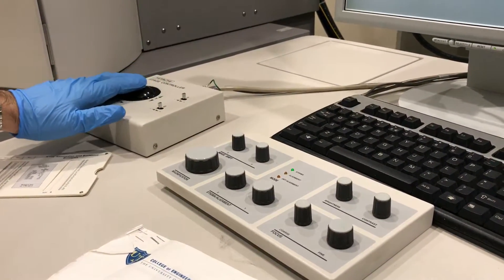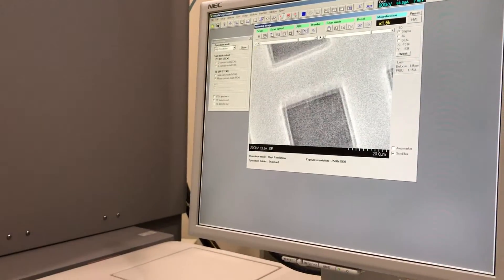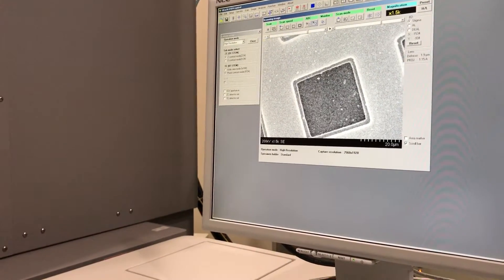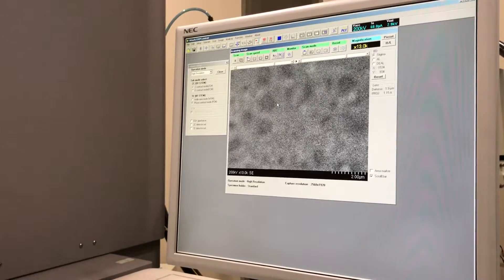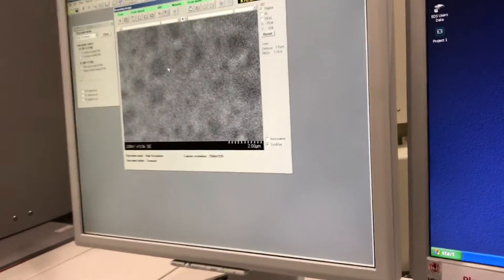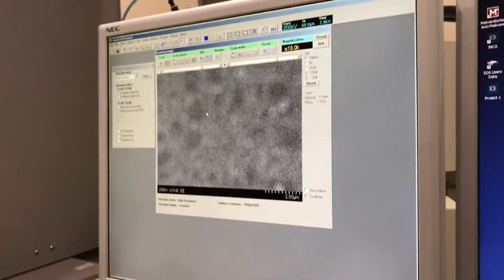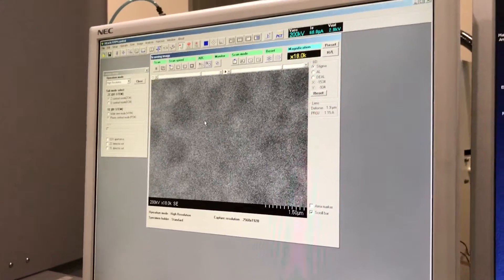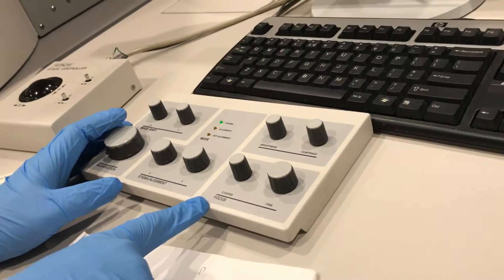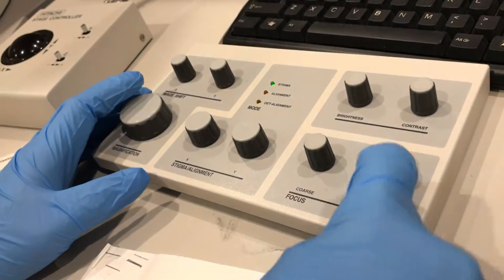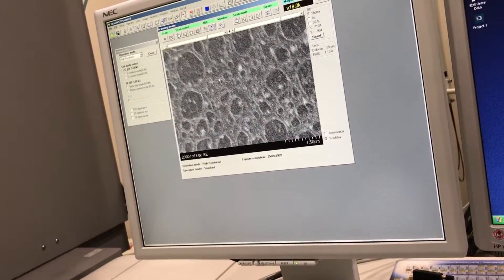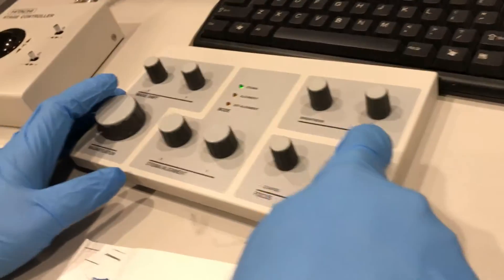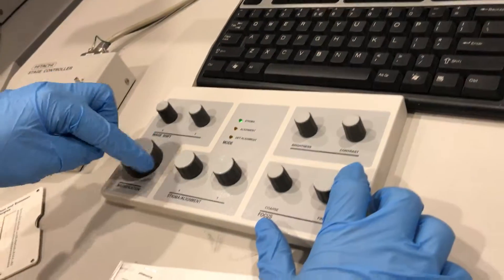Usually TEM grids look like this — these are your windows, this is your copper grid, and these are the meshes between them. If you go and zoom in inside, you start to see — in this case we have a polycarbon coating on one side, so we start to see the polycarbon structure. I need to focus on it. I have a coarse and a fine button, and I'll try to focus better on my sample. I turn the knob a little bit, then increase my magnification.